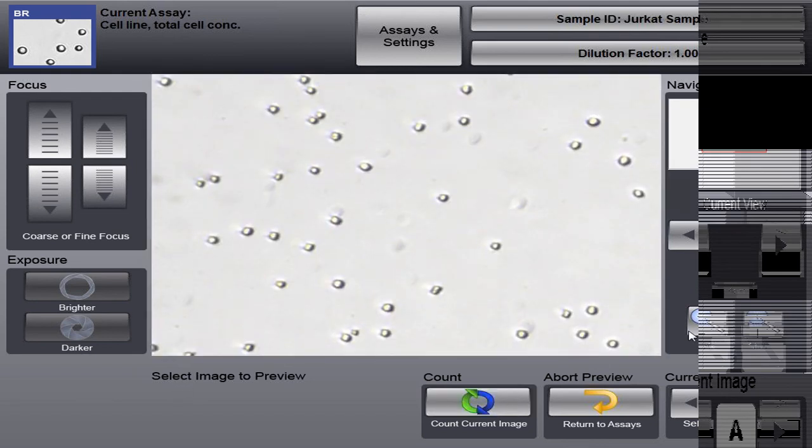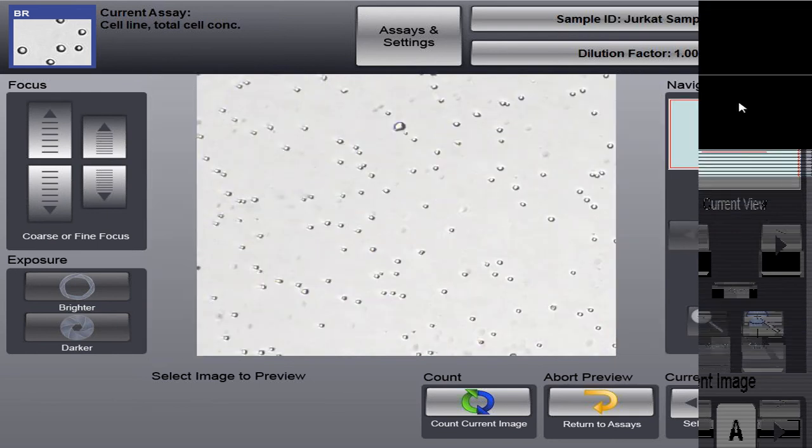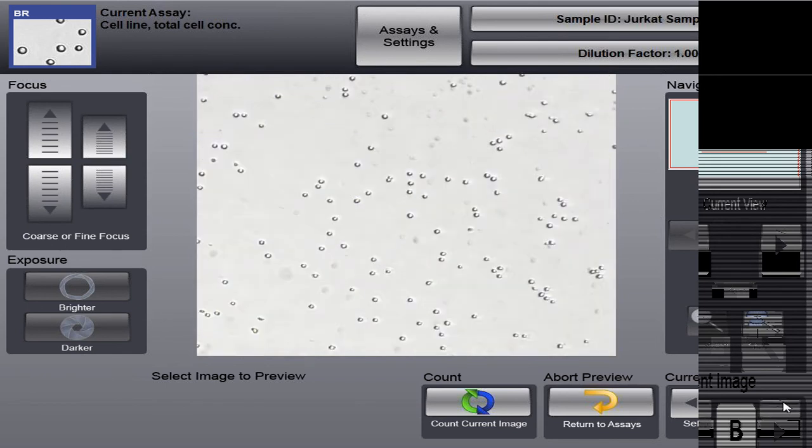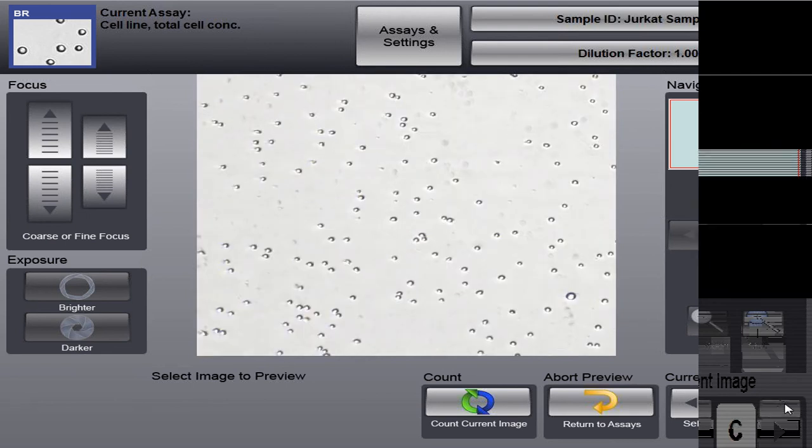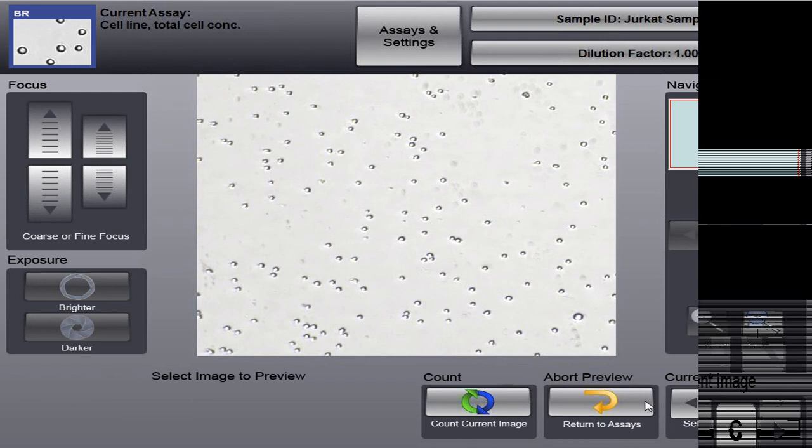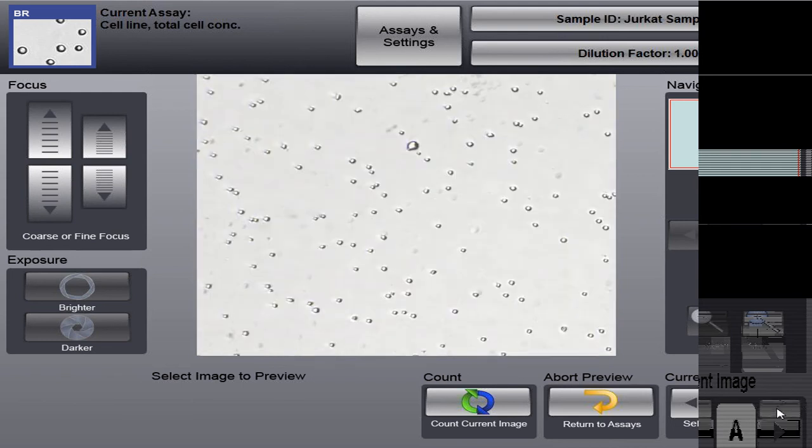So this is our Jurkat cell sample. I'm just going to zoom out so we can take a look at our entire image. And this is image A. You see down here, current image. We can select between four images, A, B, C, and D. We'll just go back to image A.